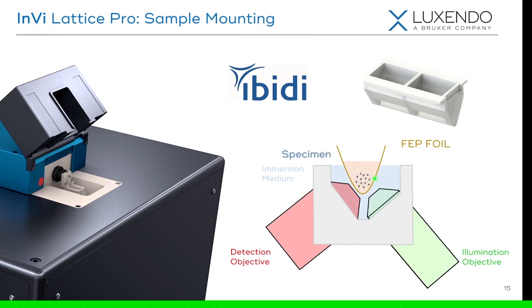Then we can either culture our specimen in these chambers or just physically drop it in, as in the case of this organoid here. And when we're ready, we shoot our light sheet out of the illumination objective, and orthogonally to that, we collect it on the detection objective. Alternatively, if your cells don't grow well on FEP or if there might be a potential problem, we do have a cover slip mount for this. Essentially, you get rid of the FEP, you get rid of the chamber, and now you fill this entire chamber with your immersion media instead of water, and then we can invert a cover slip in there.